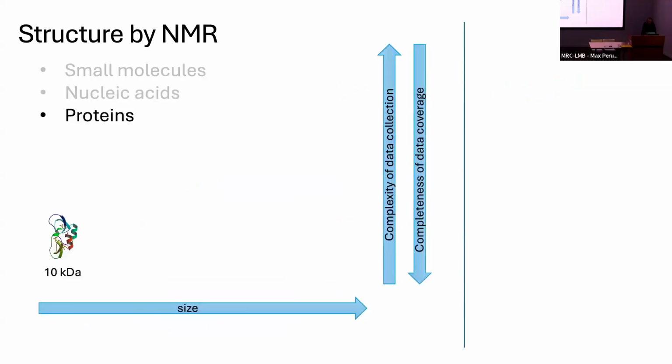But the bread and butter of the work that we do in the NMR facility is looking at proteins, and that's proteins in the solution state. And this is really important. The size of the protein is quite important to the kind of information that we can give you.